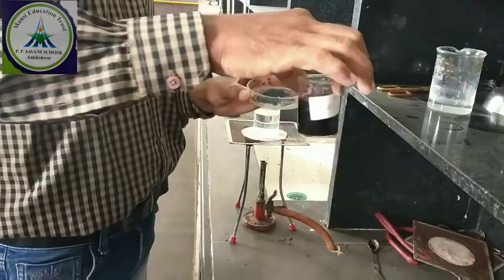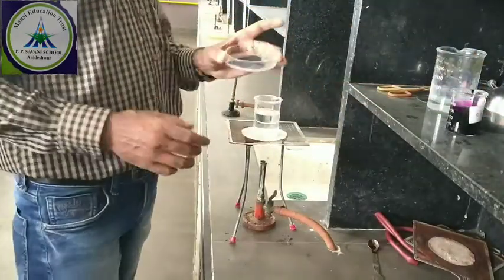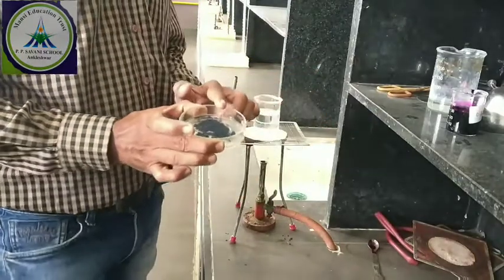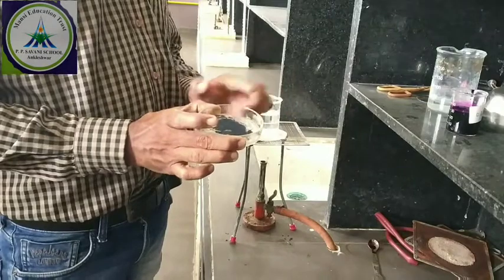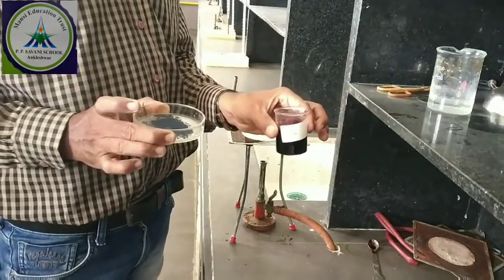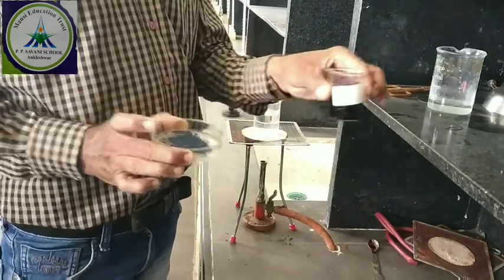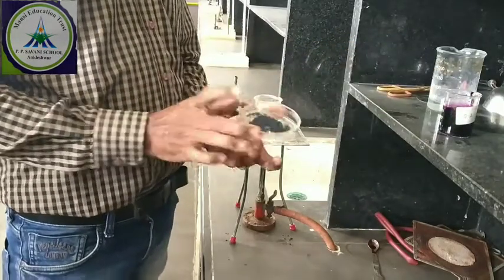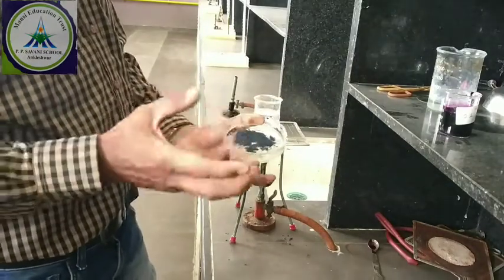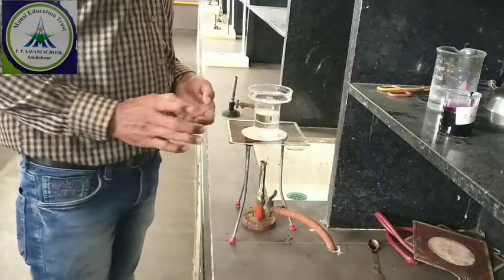This is the ink completing. I will vaporize it, and when it vaporizes, we get the pure solvent. This component is non-volatile. This ink contains both solvent and solute. The solvent is vaporized, and the solute remains. So we can separate the red, blue or black color dye from the ink by this vaporization process.